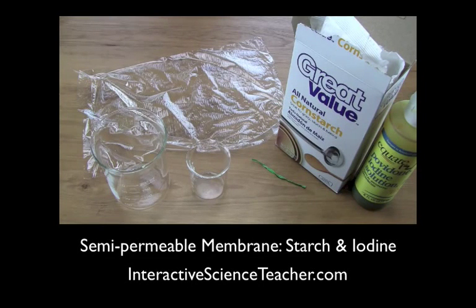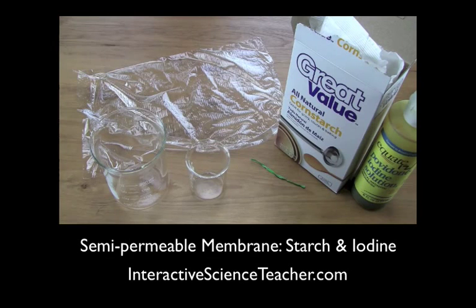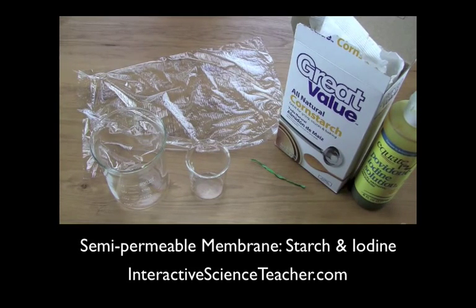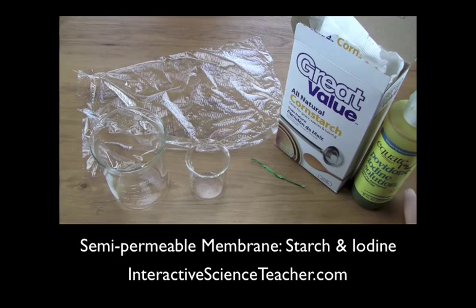If you're doing selectively permeable membranes and passive transport and you'd like to do the iodine and starch inside the baggy demonstration — where they react on the inside or the outside of the bag depending on where you have the starch and the iodine — but you don't have dialysis tubing, here's what you can do.